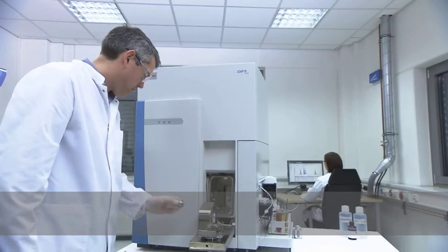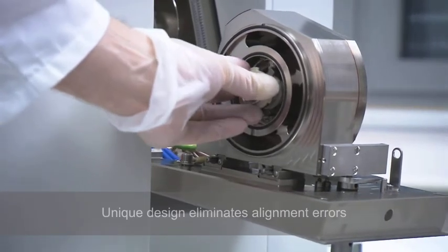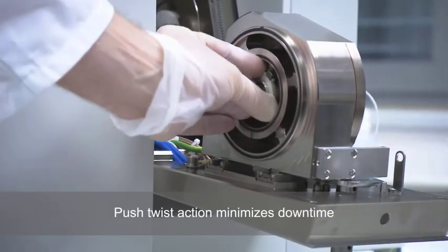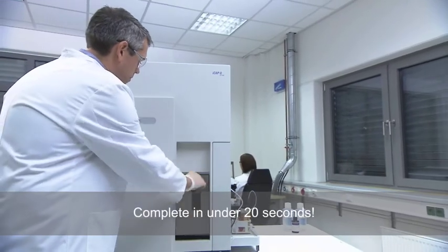The unique one-piece lens and bayonet design eliminates alignment errors. A push-twist action quickly reinstalls the lenses and minimizes downtime. Complete and ready for analysis in under 20 seconds.